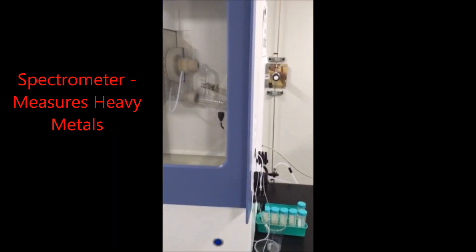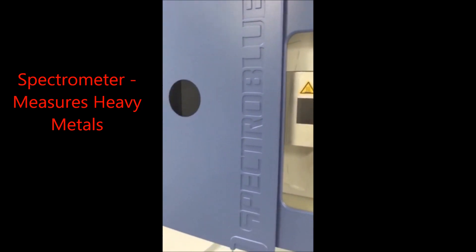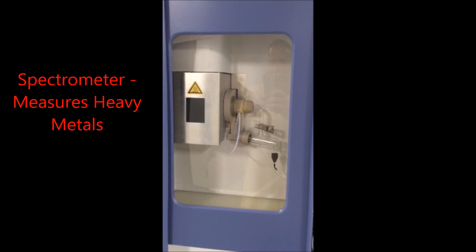This testing machine will test for heavy metals. You put it inside the chamber and it will pull out any kind of heavy metals that are in any product, including lead.